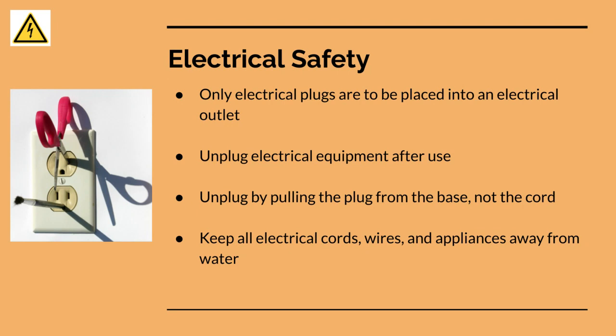Okay. And then keep all electrical cords, wires, and appliances away from water. Again, super duh kind of moment. Now, for those of you wondering why there are sinks next to these outlets, these are GFCI outlets. So if any water gets anywhere near these, they pretty much all shut off at the same time.